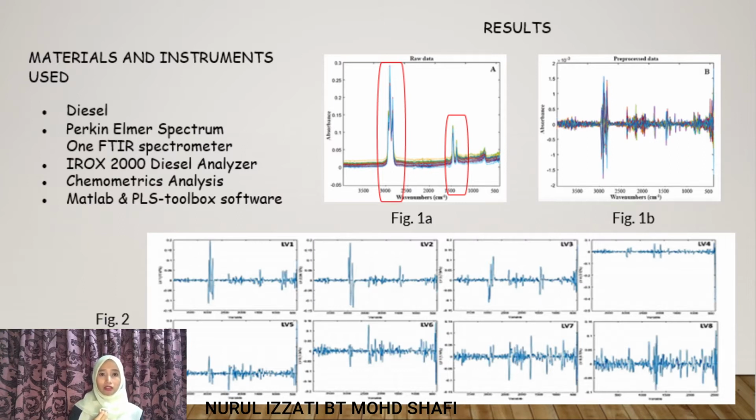For the result, as you can see in figure 1a, two main absorbances at 2900 and 2830 cm-1 respectively, associated with symmetric CH3 and CH2 stretch, were highlighted. Two other weak bands were observed at 1445 and 1400 cm-1, caused by asymmetric deformation and the CH2 scissor bending vibration respectively.